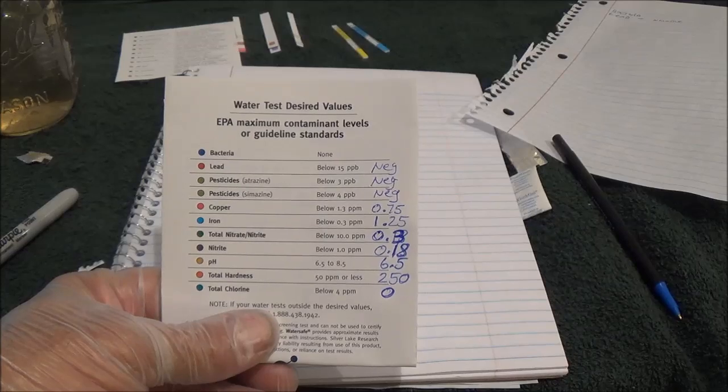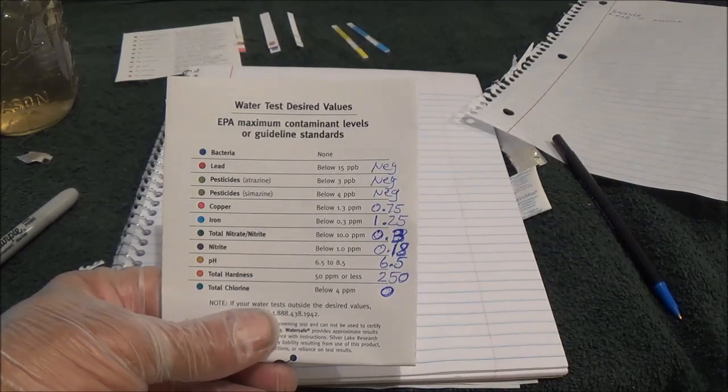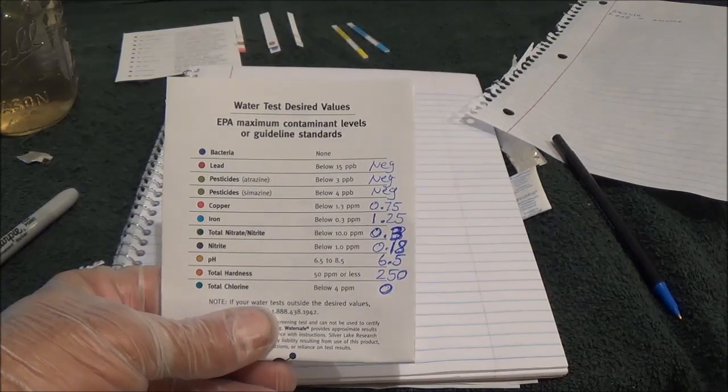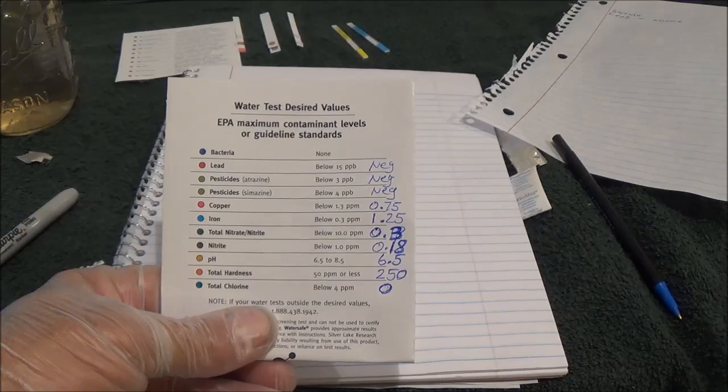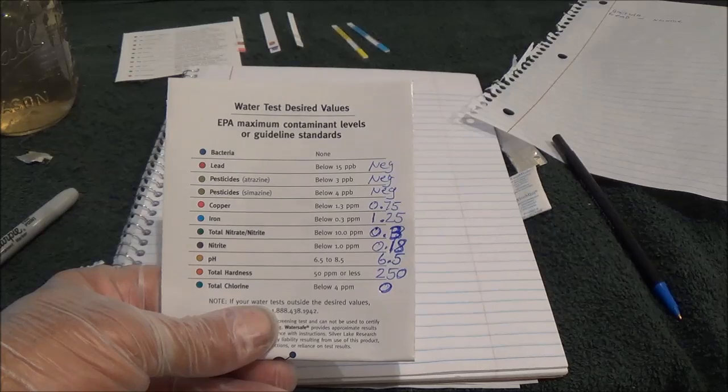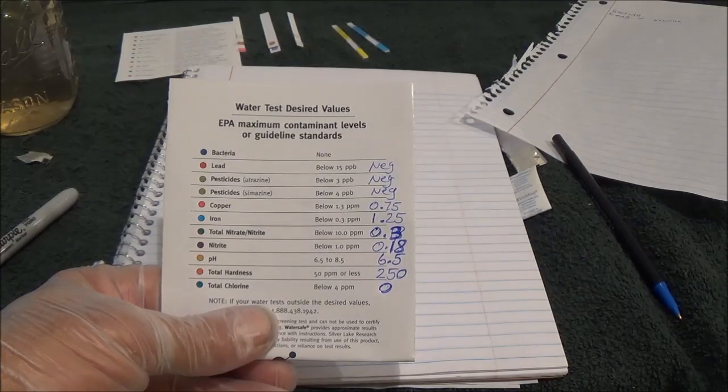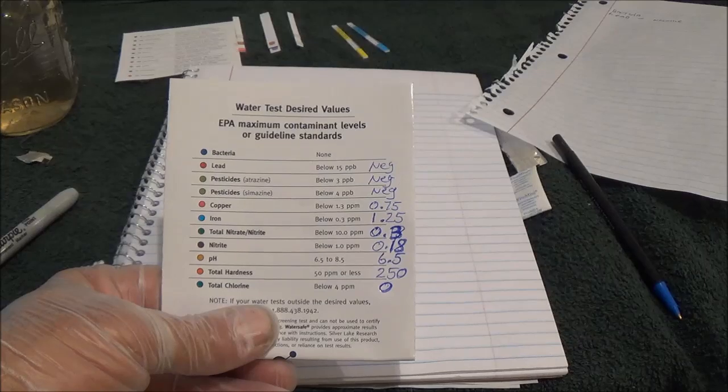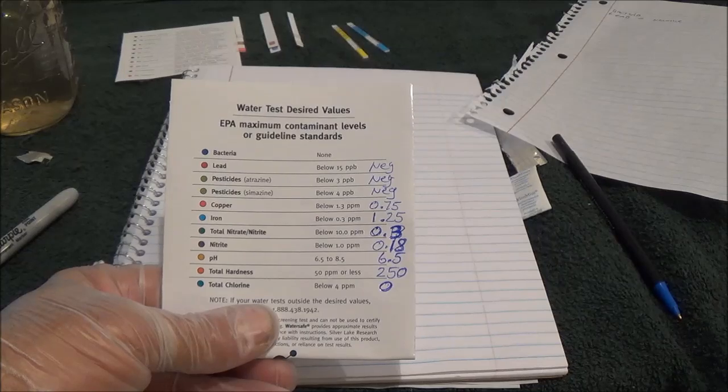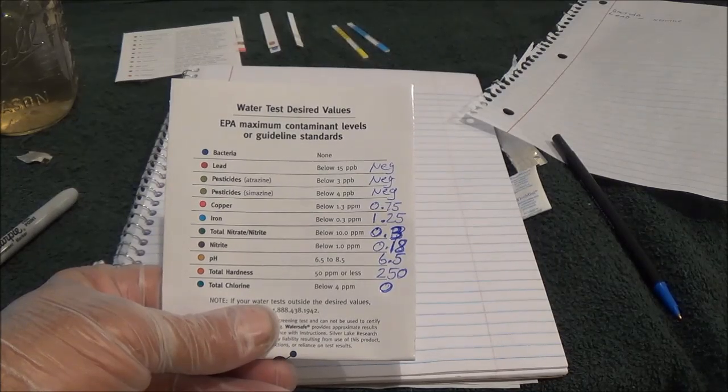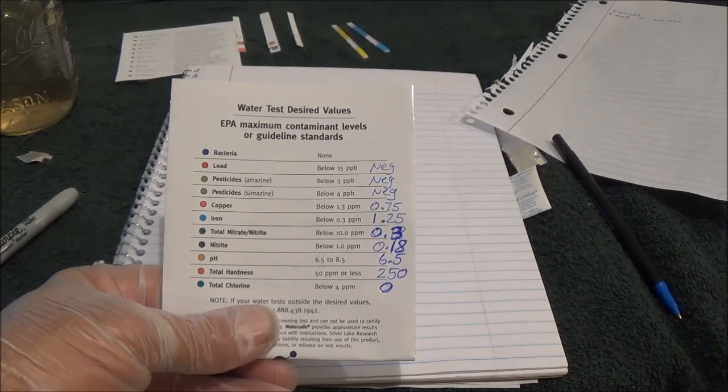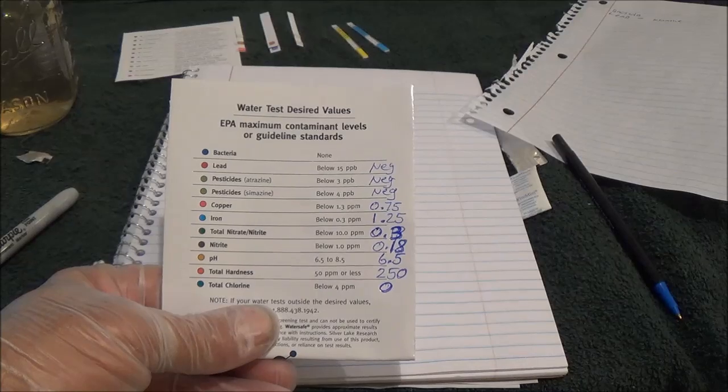Alright, so looking at our total results minus the bacteria, we're still waiting on that one. For lead, they suggested below 15 parts per billion. We were negative. Pesticides, the two kinds that it tested for, were supposed to be below 3 parts per billion and 4 parts per billion. Both of ours were negative. Copper is supposed to be below 1.3 parts per million. We were at roughly 0.75, we're good there. Iron is supposed to be below 0.3. I was at 1.25. We knew we were going to have high iron up there, and we did.